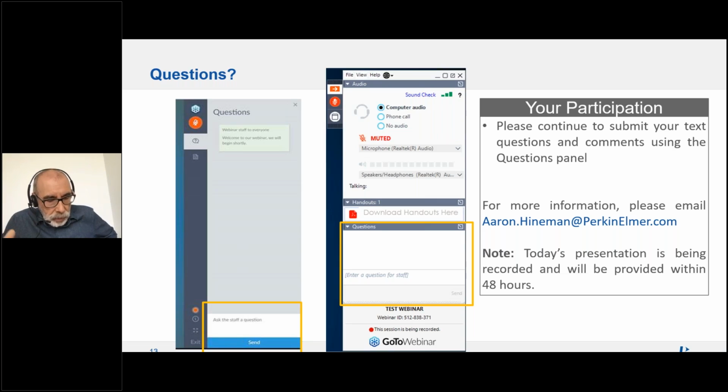But what is important from our point of view is that this method must be considered a screening method. By using this method, we can know that we have microparticles, of course, in the range of 1-3, but at least we know that we have these microparticles, and then we can move to another technique. The key point here is the screening capability of the method.